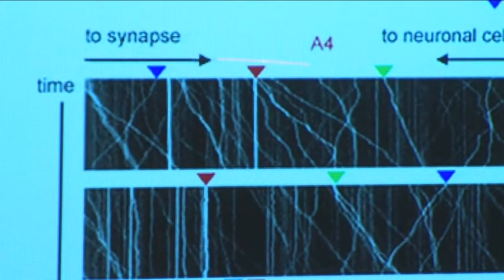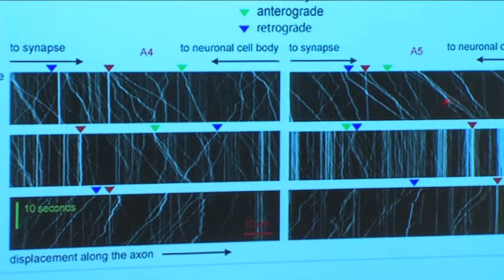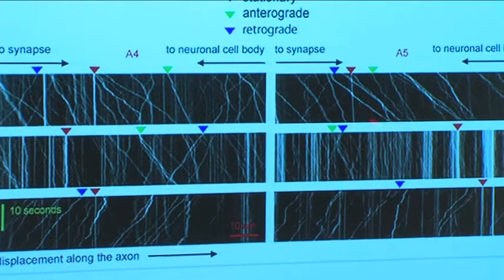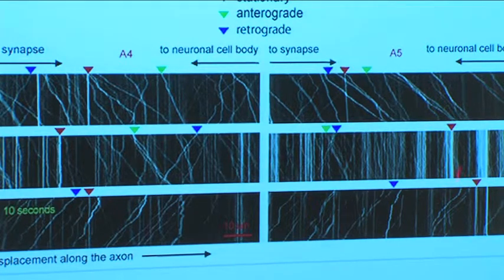When we look at all the flies we have and look at the APP vesicles, this is control. You can see a fairly large fraction of particles going towards the distal end, towards the synaptic terminal. Whereas when we overexpress the human tau, you can see that the transport is significantly impaired, and you see a lot of stationary vesicles.